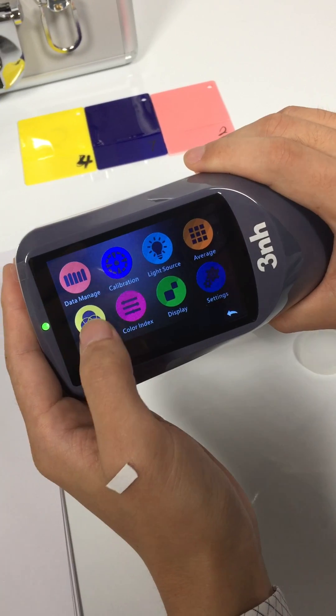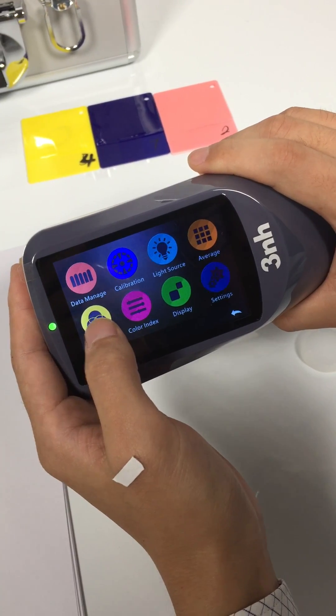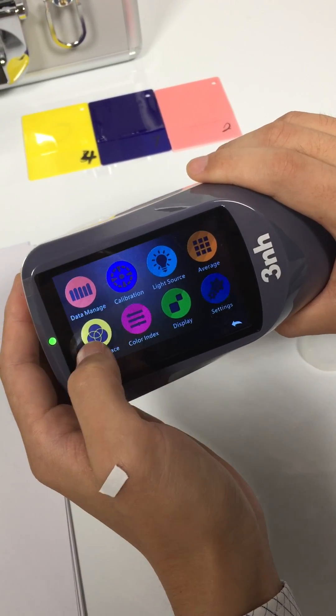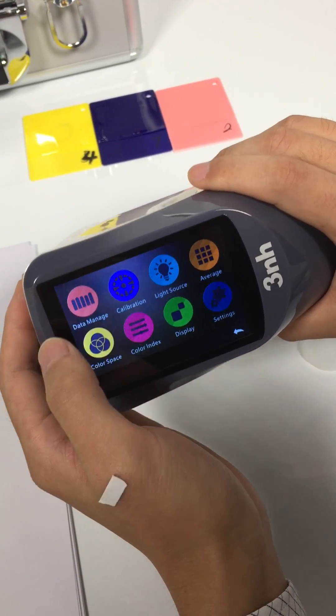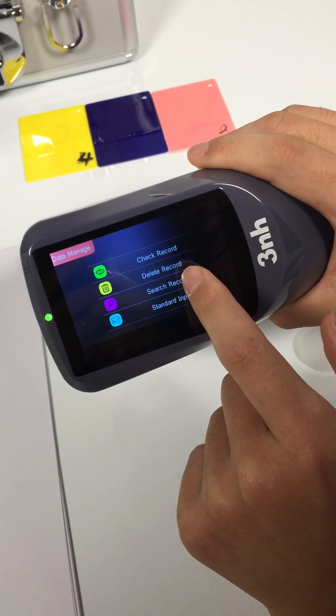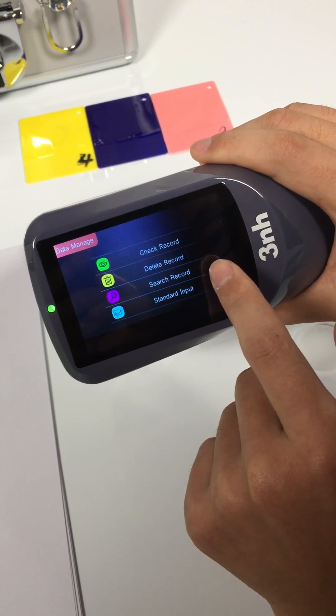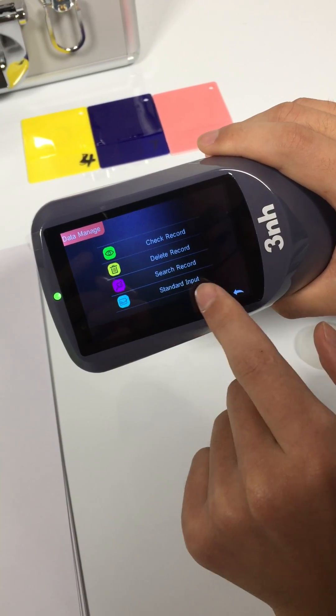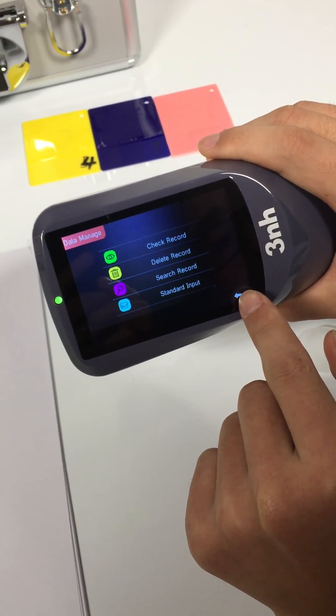Menu interface. Data management — you can search records, delete records, and input standards.